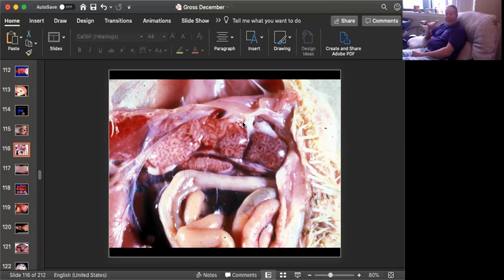Okay, time's up. We're looking at the kidney. On one side of a chicken, it has 3 lobes. Some people say that chickens have 6 kidneys. I think they have 2 and they have 3 lobes, but I'm not an anatomist. And what we're seeing is an outline of every single tubule in this. Now, there's a couple possibilities here. The tubules are outlined. They are whitish.